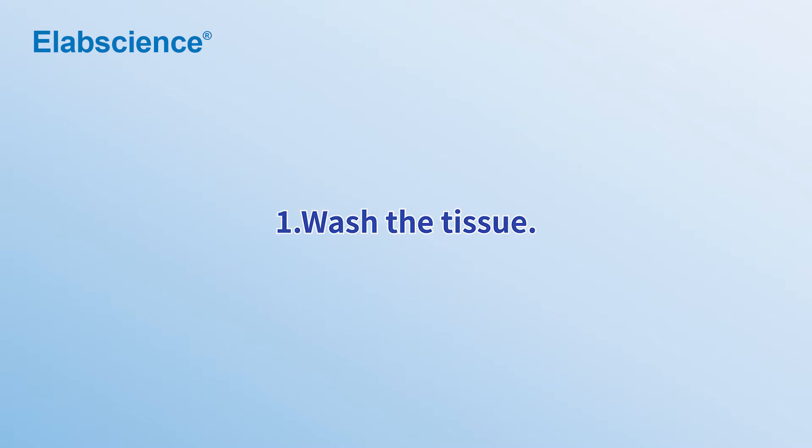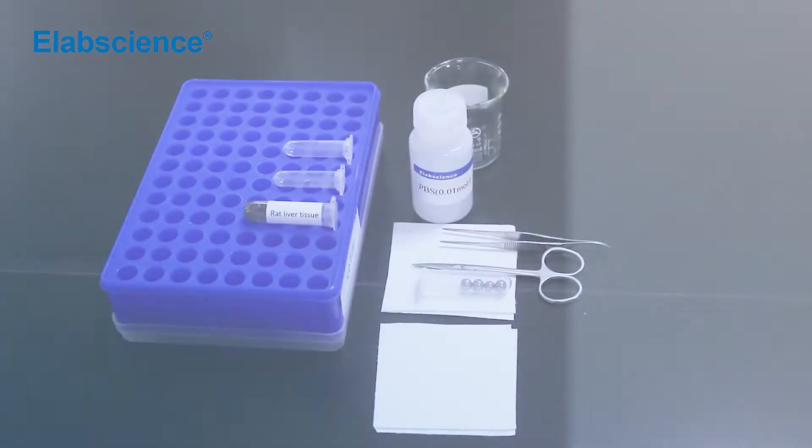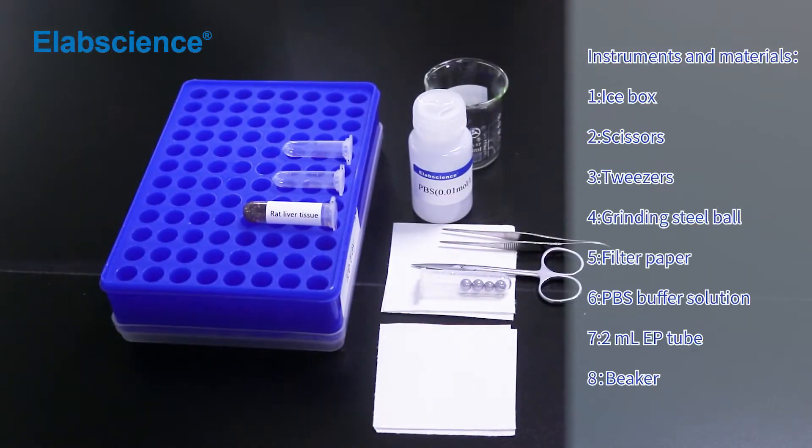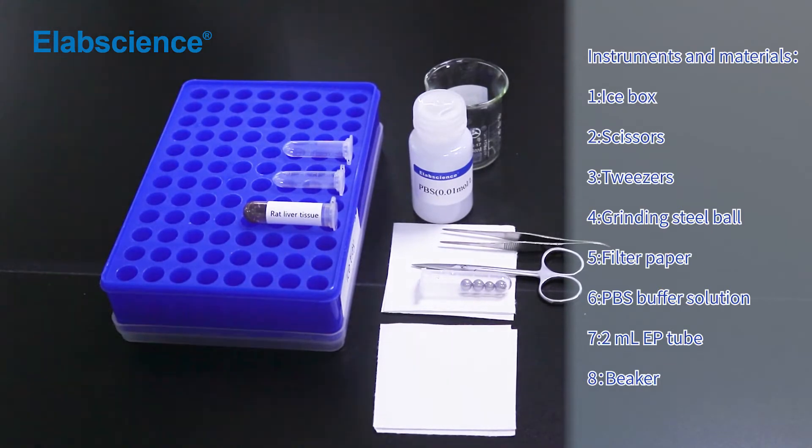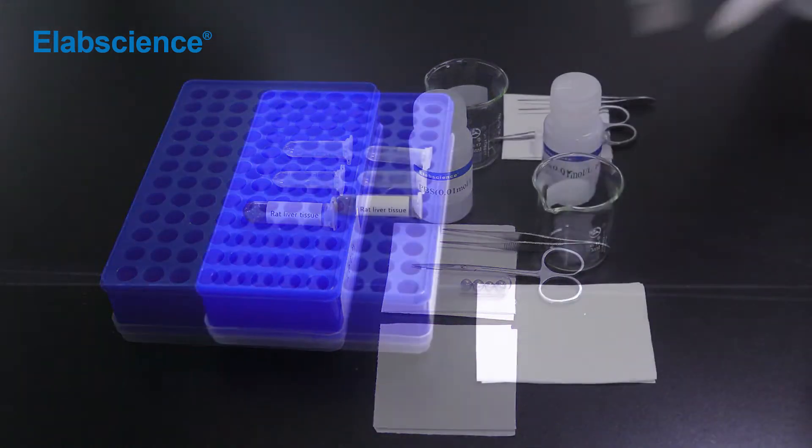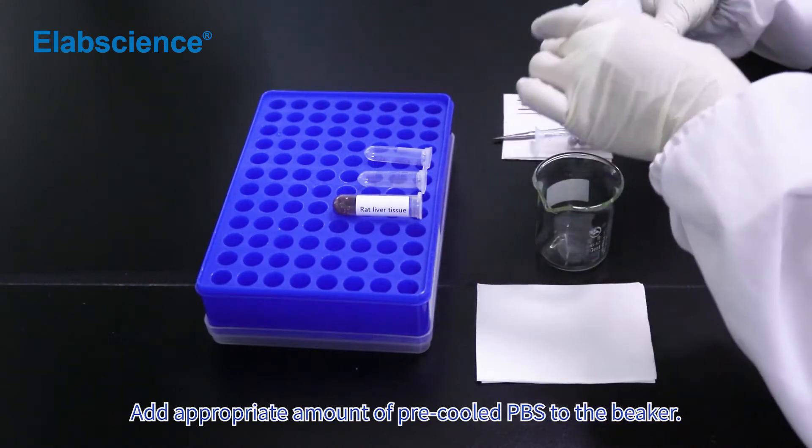Preparation of Animal Tissue Homogenization. Wash the tissue, instruments and materials. Add appropriate amount of pre-cooled PBS to the beaker.